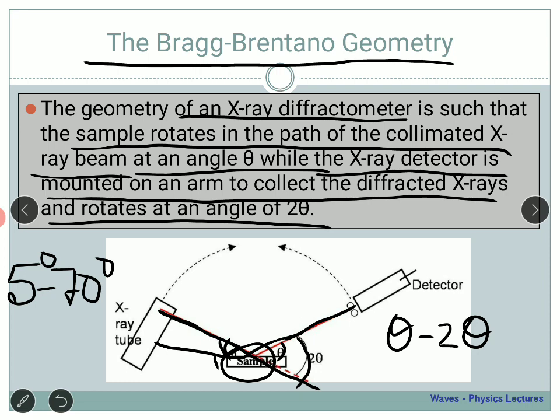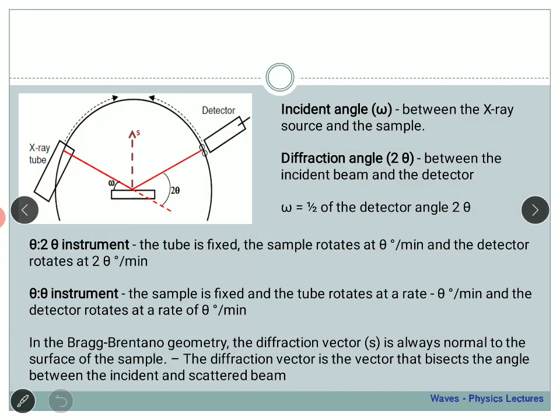On the other hand, if we look at 90 degrees or 70 degrees, we can go up to this point. Now if this goes to a larger angle, we can have a different scenario. We won't be receiving any kind of signal there. But before we do that, let's try to understand a few of the basic concepts.